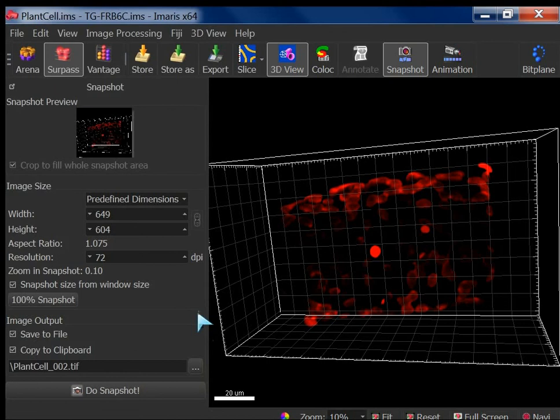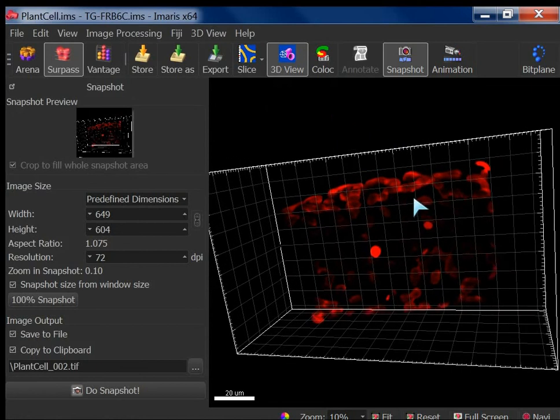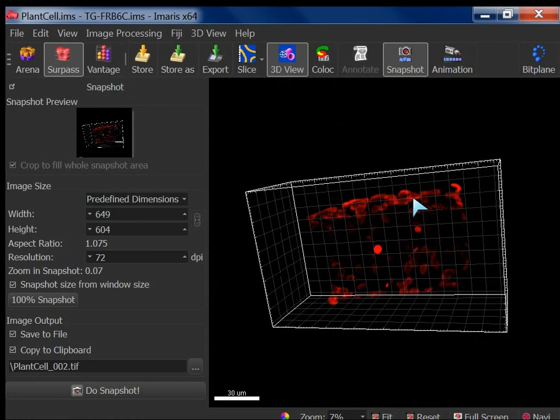Then we have to go for Imaris Cell, Imaris tracking. We have to cover that in the next one also. Yeah. There are a lot of things for tracking. But actually we are good. We have covered a lot, at least the basics. And then we have to cover the co-localization also. But that will be next, or maybe next to next. It's too many things. Yeah, but animation will take time, so maybe we'll do it next time.